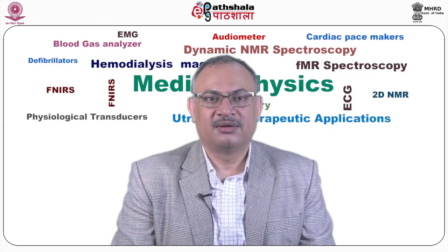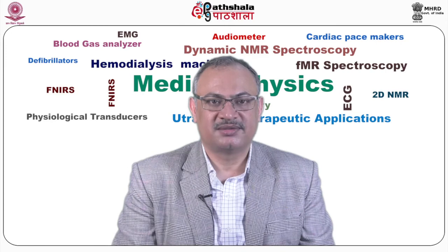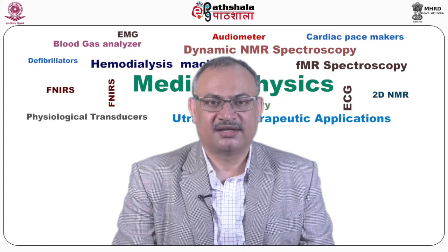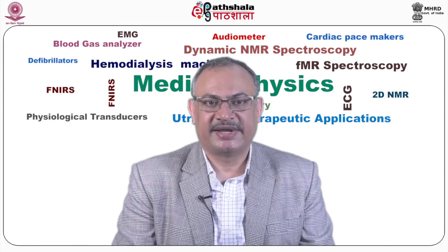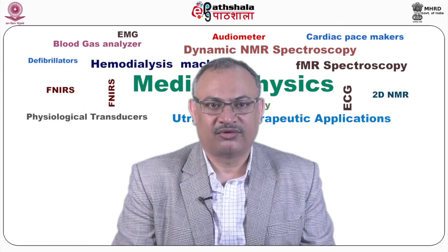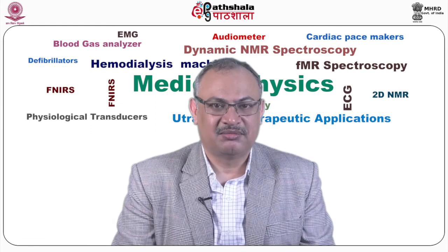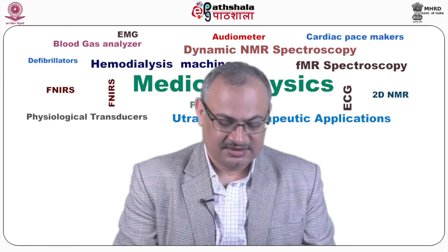This is followed by isotropic C13 mixing, and finally magnetization transfers back to the side chain hydrogen atoms for detection. Both the side chain protons and carbons are frequency labeled. This experiment helps to correlate the chemical shift information obtained from 3D HCCONH-TOCSY and 3D (H)CCCONH-TOCSY.